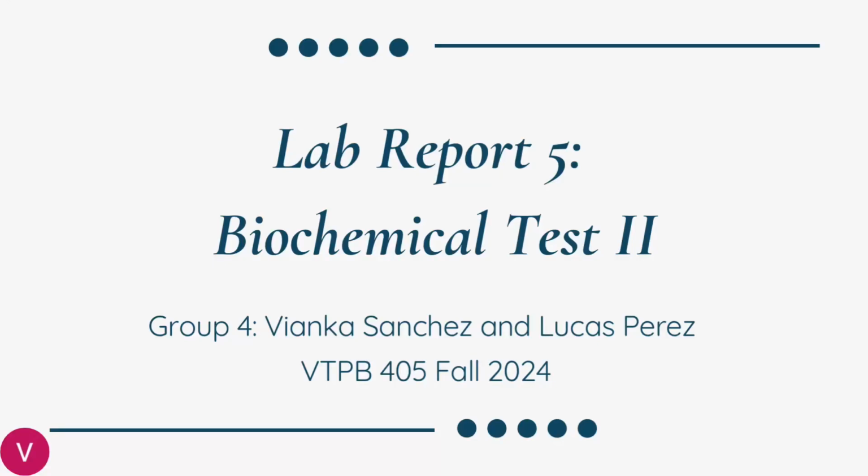This is Group 4's Lab Report 5 on Biochemical Test 2 by Vianka Sanchez and Perez.